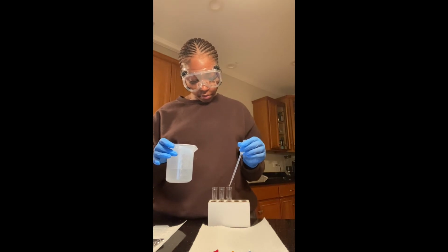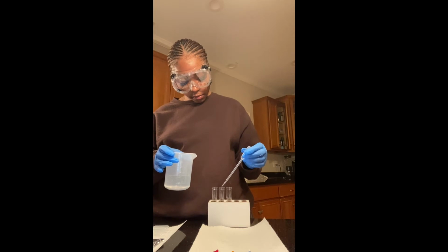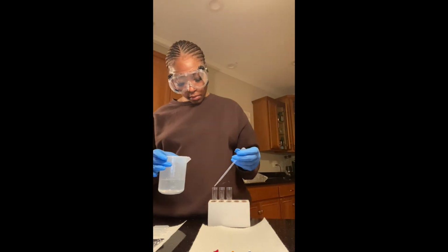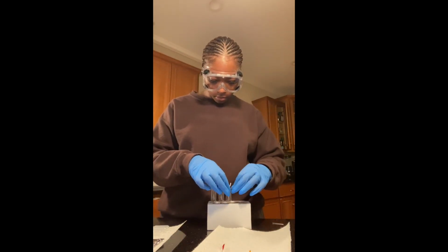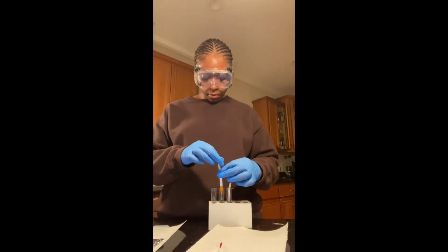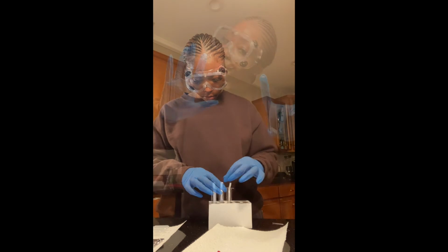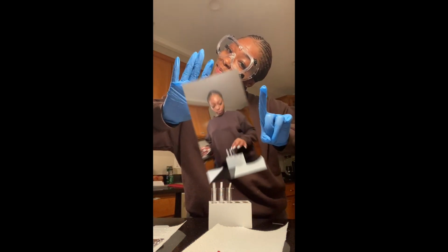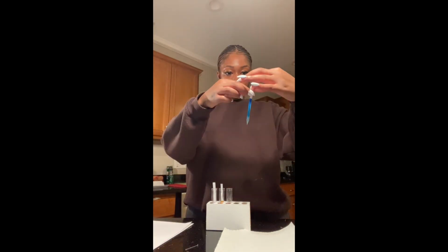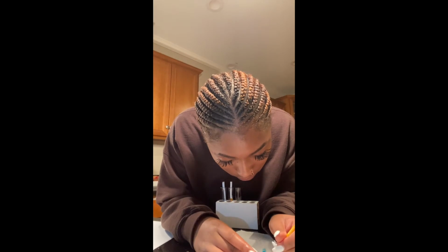Next, we want to take our sodium chloride water that we made at the beginning of the experiment and put 3 drops of that in 3 test tubes. We're then going to take our chromatography strips with the food dye on them and place them into each test tube. What we want to see is that each food dye travels up the chromatography strip at different rates. This is going to determine our retention factor of the food dyes, and this is going to determine if any of those food dyes are present in our Kool-Aid mixtures.